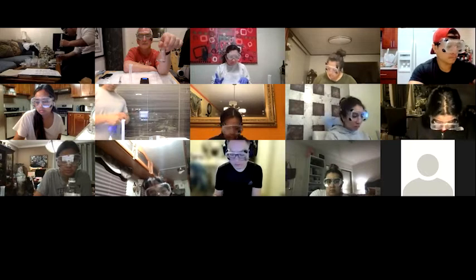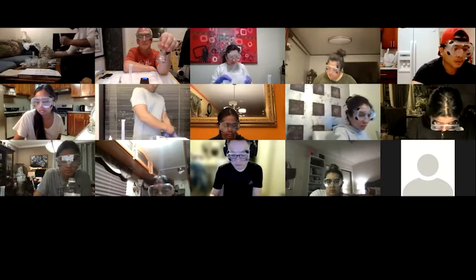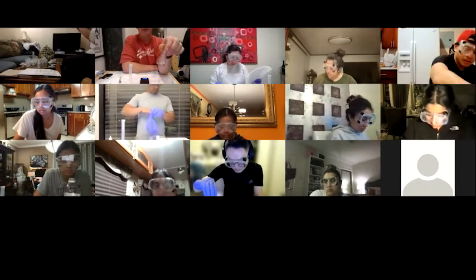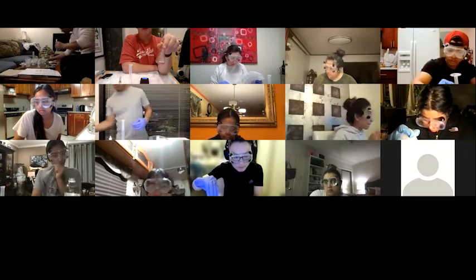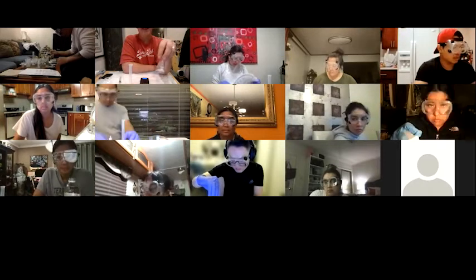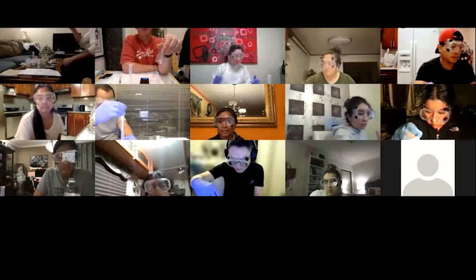What is it? Two things equal each other at the end of the titration. Something between moles. Whoops, I gave it away. It's moles. It's when moles of acid equal moles of base.